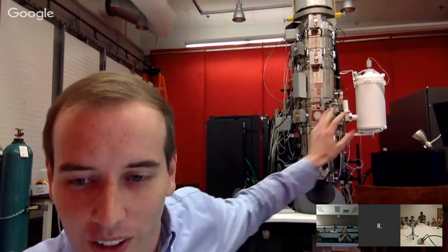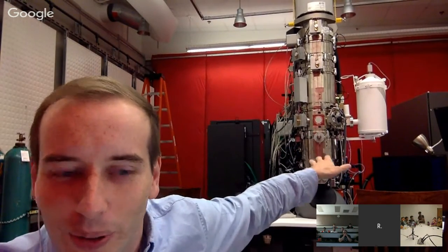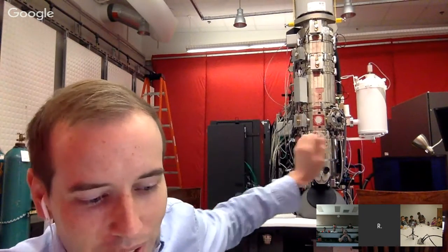It's a complex machine. At the top of the machine, electrons are ripped from a nanoscale tip. They're accelerated to relativistic speeds. These electrons come flying down the column as quantum mechanical waves, and they crash into the samples that we put in front of them. When they hit these samples, they scatter in particular ways that we can use to understand the material. They also interact with the energy states inside that material and give off unique spectroscopic signals. If we can take all that information and collect it in an understandable way, we can learn something new about the materials we're interested in.